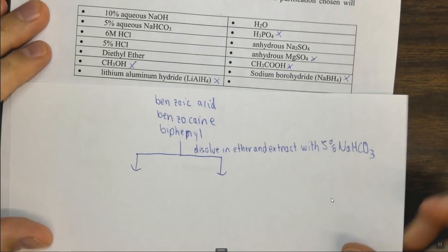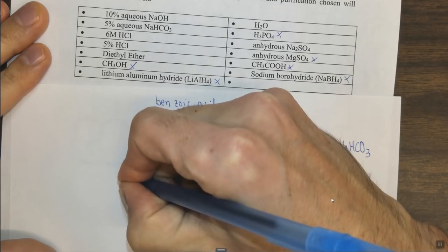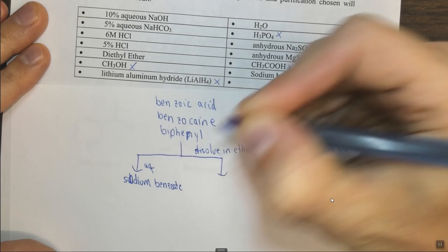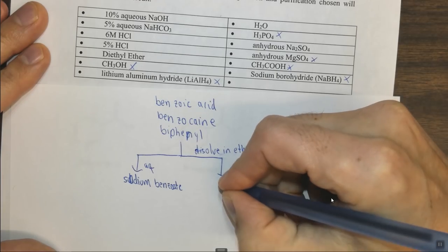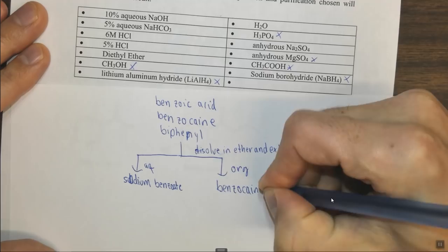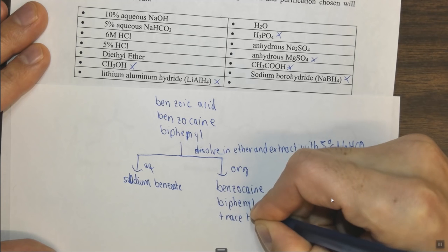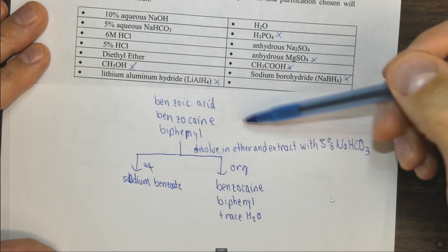So moving back to our separation scheme, in the aqueous layer, we're going to have sodium benzoate. And then in your organic layer, we're going to have benzocaine, biphenyl, and traces of water, because now we've basically done a liquid extraction.